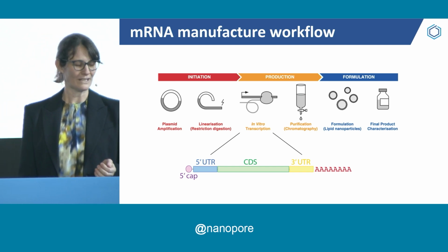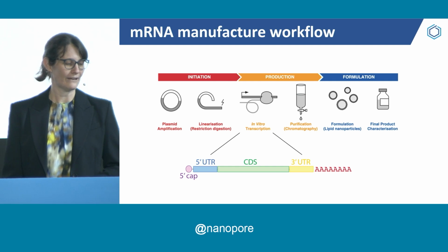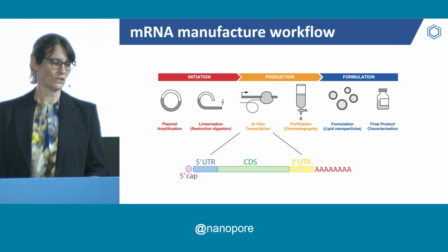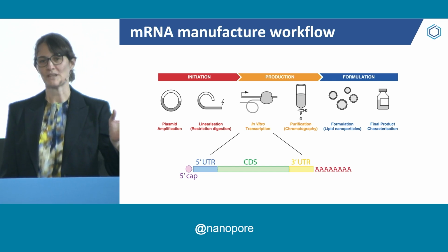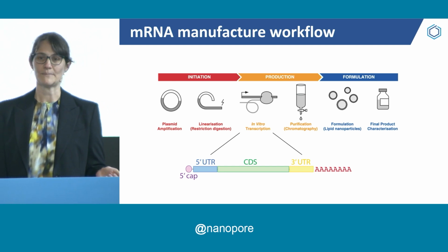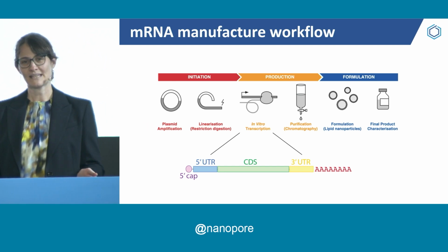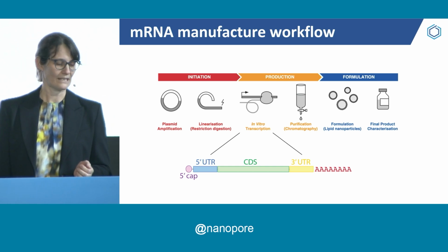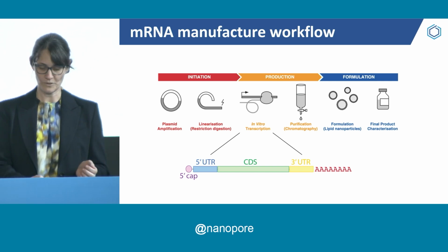Now, what's really important is that during the in vitro transcription reaction, anything can go wrong, right? You can have SNPs, for example, that might get introduced. There could be truncations. You could have transcription that ends before the end of the mRNA. And also, during the plasmid propagation step, there can be truncations in the plasmid template. All of these can have major influences on the efficacy and safety of these mRNAs, so understanding whether or not they've arisen during manufacturing is extremely important.